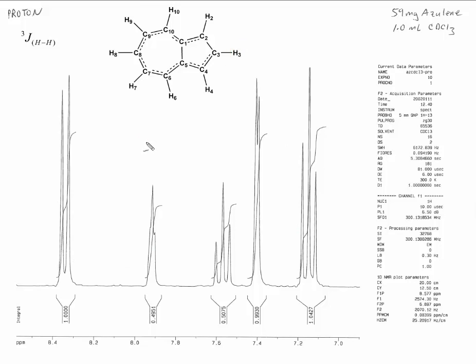Now, which of these protons goes with which of these peaks? You have all the information you need, the splitting patterns, the integrals down below. Go ahead now, pause the video, and see if you can't make these assignments. In other words, tell me which protons go with which of these 5 peaks.